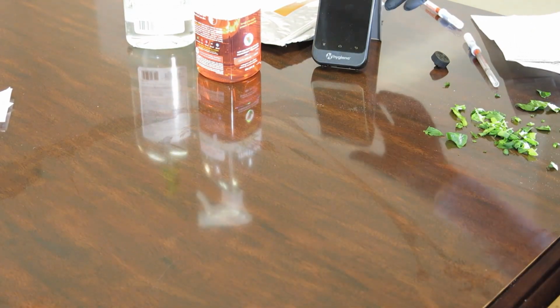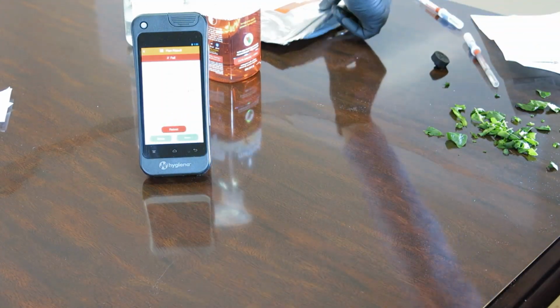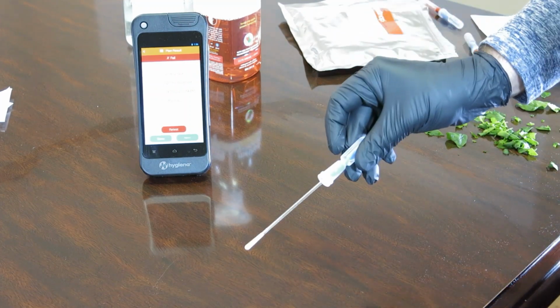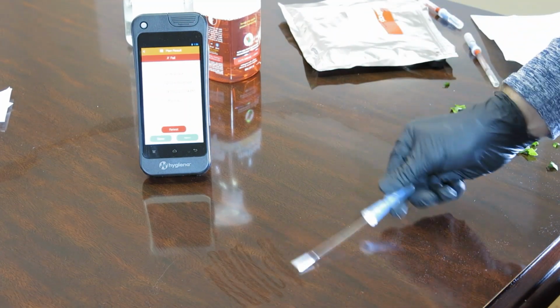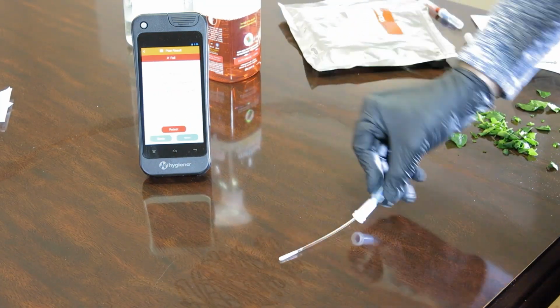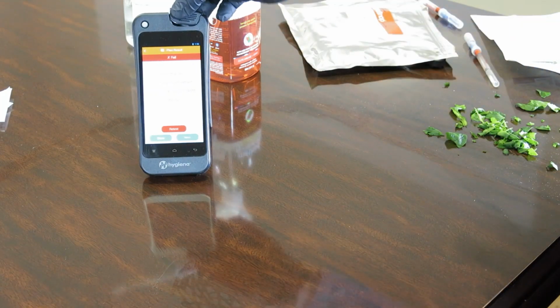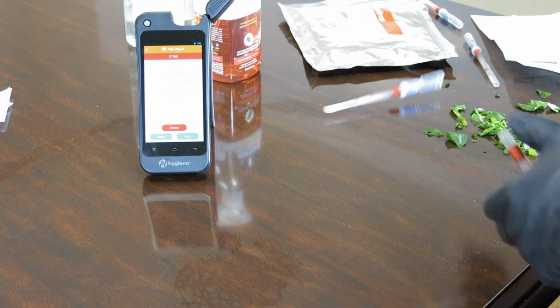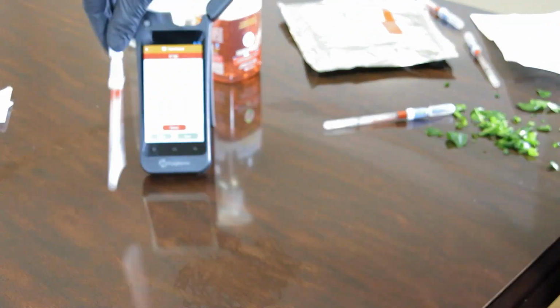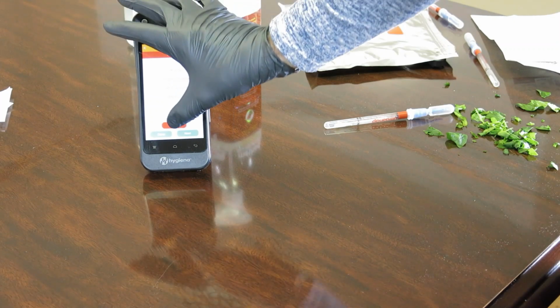All right, let's see how this goes on a retest. It's a nice function on here. It's actually got a retest, so we can just put multiples down for that same treatment. So we'll just do our swabbing technique here, back and forth on 10 centimeters or so per side. Take the old sample out. Put this one in, break it, squeeze it, spin it, press retest.